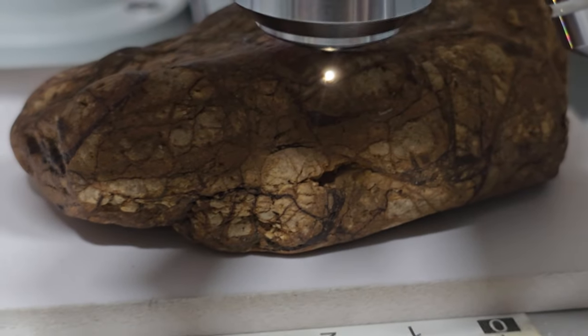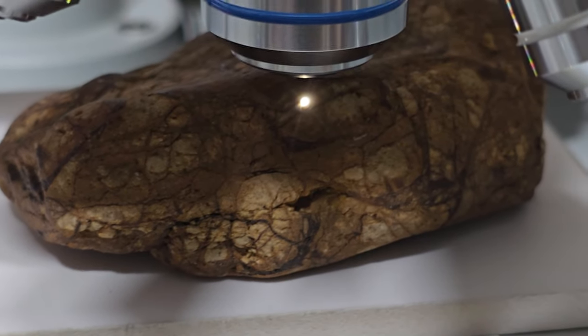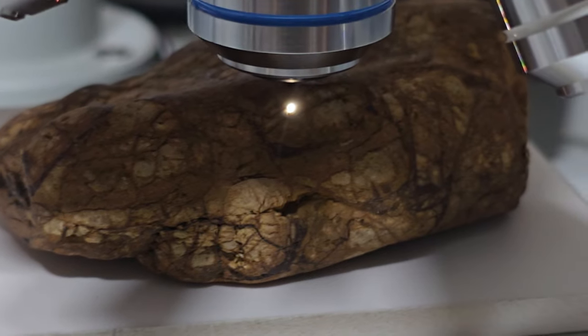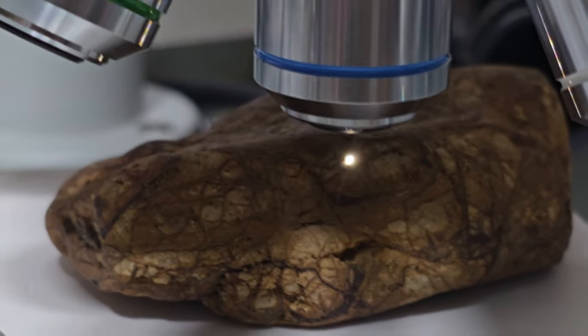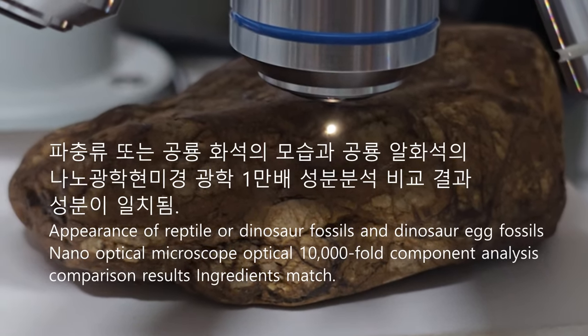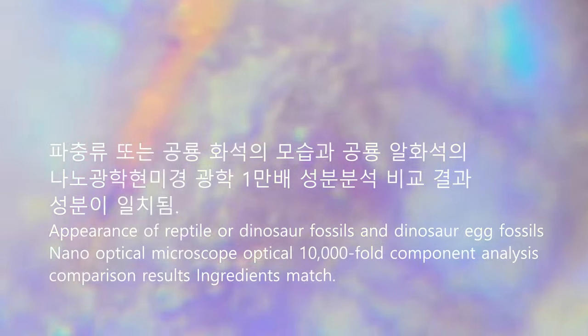지금 보고 계시는 파충류 공룡화석을 디테일이 보이시죠. 보통 파충류의 모습을 그대로 볼 수 있는데 이빨의 끝까지의 모습입니다. 이 공룡돌화석의 모습을 보고 유사점을 찾는데, 지금 광학 만배에서 아주 세부조직의 입자들의 모습을 보면, 이 하석과 아까 모습하고 일치가 되네요.